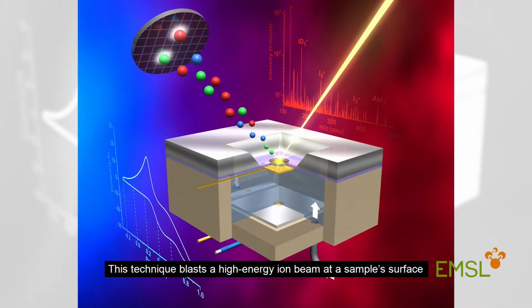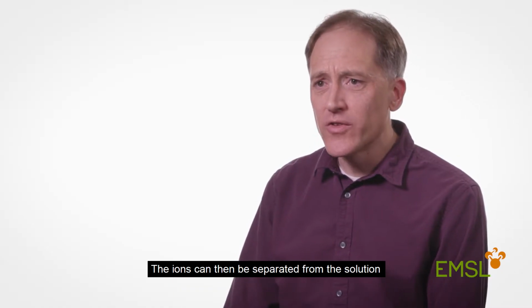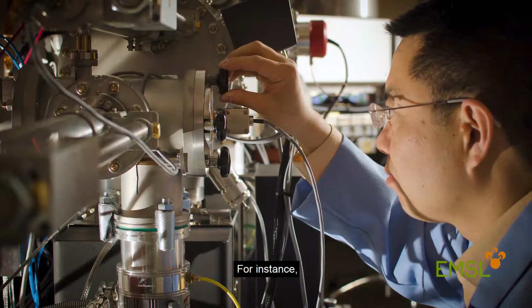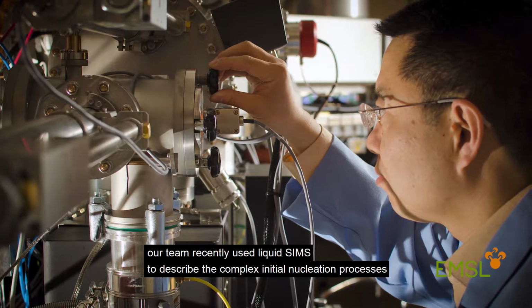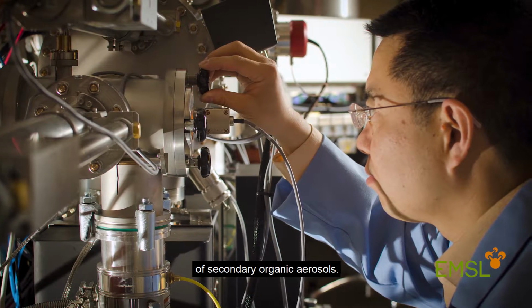This technique blasts a high-energy ion beam at a sample surface to ionize molecules suspended in solution. The ions can then be separated from the solution and detected by a nearby mass spectrometer. For instance, our team recently used liquid SIMS to describe the complex initial nucleation processes of secondary organic aerosols.